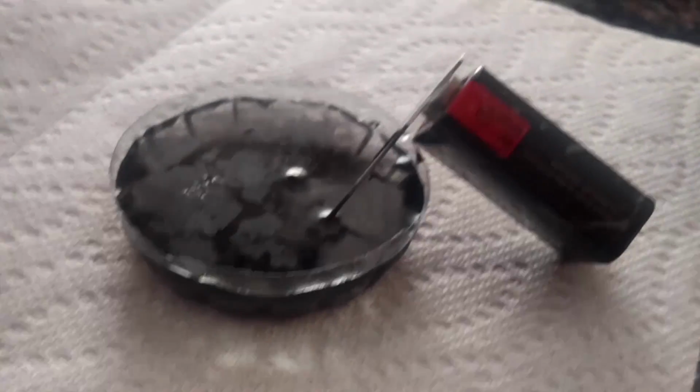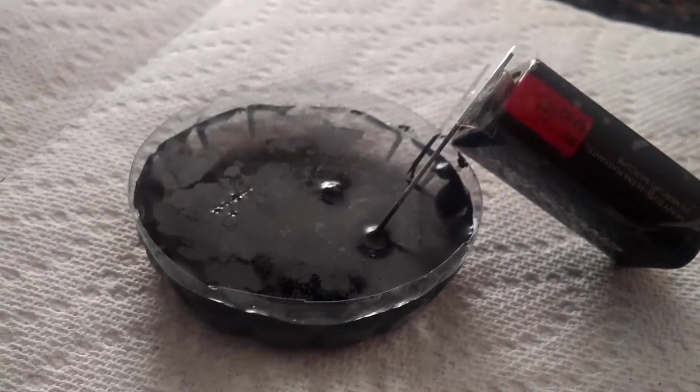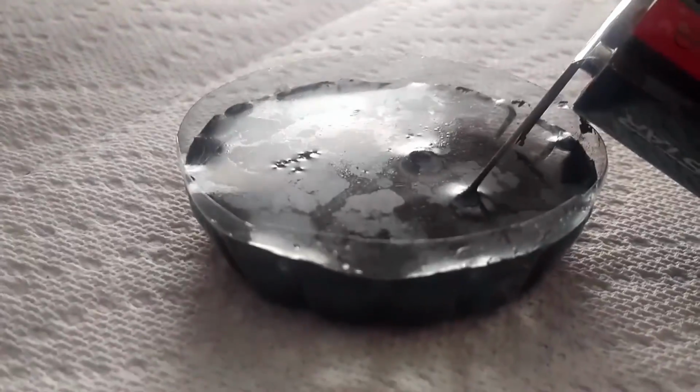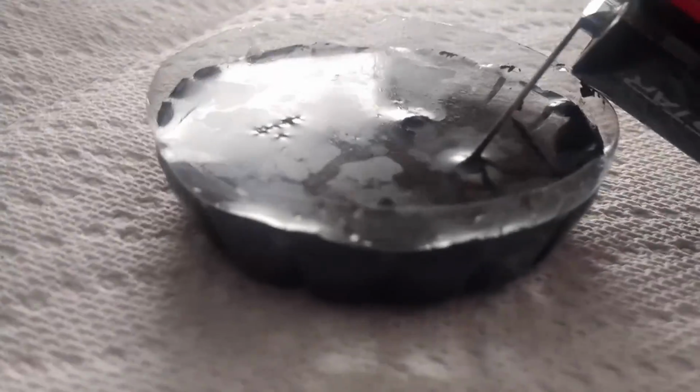2 hours later. On the surface of the solution, you can see flakes of what is hopefully graphene. It's very difficult to test these, considering the fact I have no instruments which let me measure to the precision of atoms. But hopefully we'll be able to find the electrical resistance of these pieces, and maybe they'll be similar to that of real graphene.